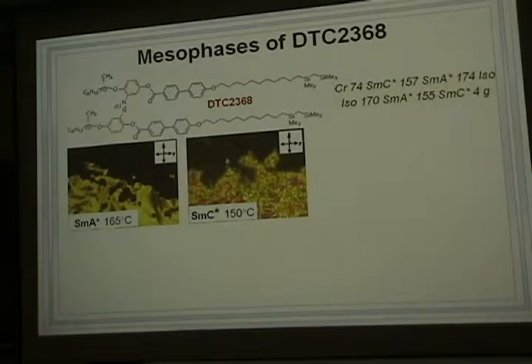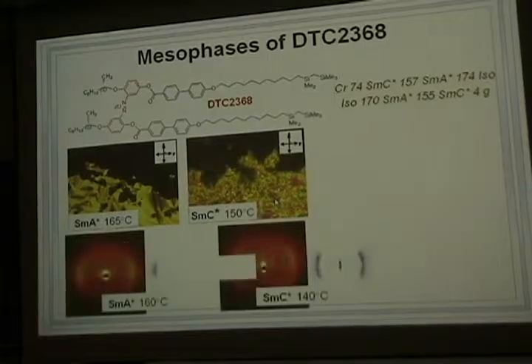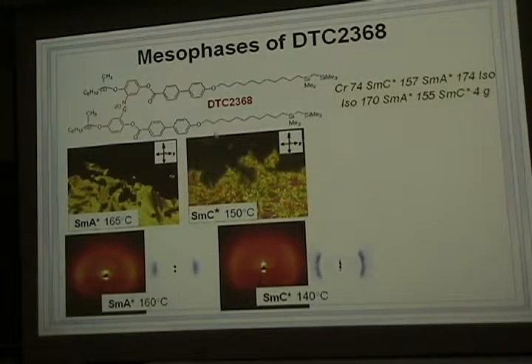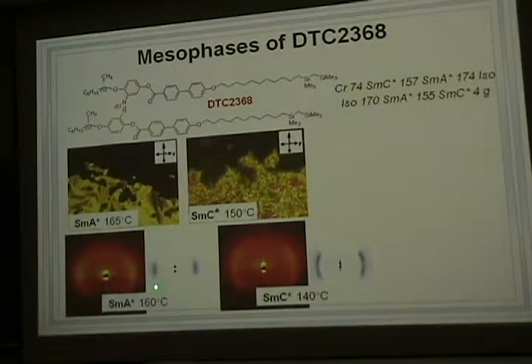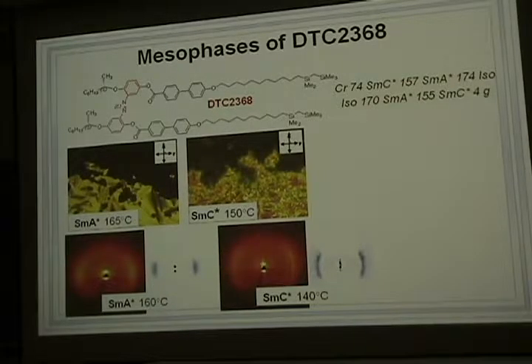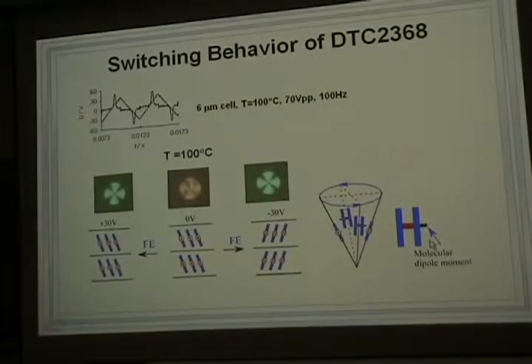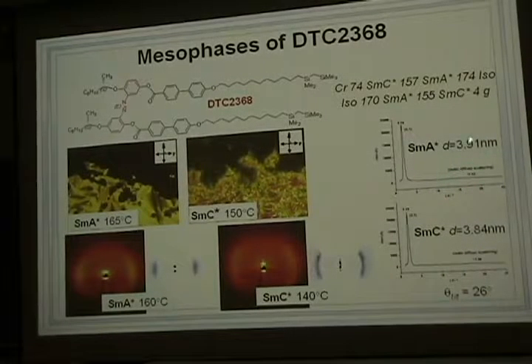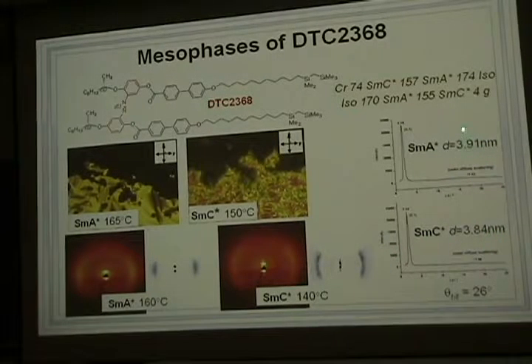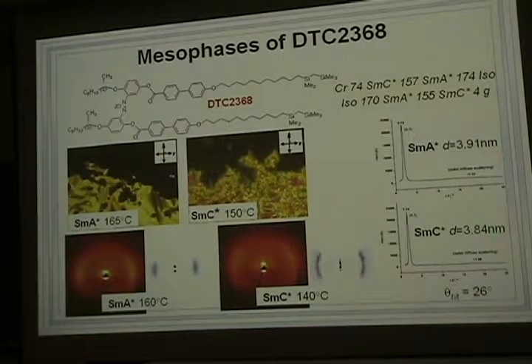Here is the schlieren texture in planar area for smectic C* phase. This is the 2D X-ray diffraction pattern of this compound, showing the smectic A phase and smectic C* phase patterns. We can get the layer spacing for smectic A phase and smectic C* phase. The layer spacings are almost very close, which suggests a small tilt angle for this material. This is the X-ray tilt angle.